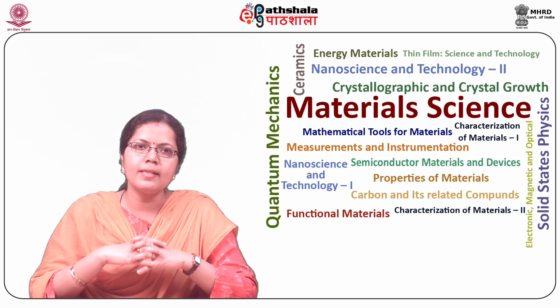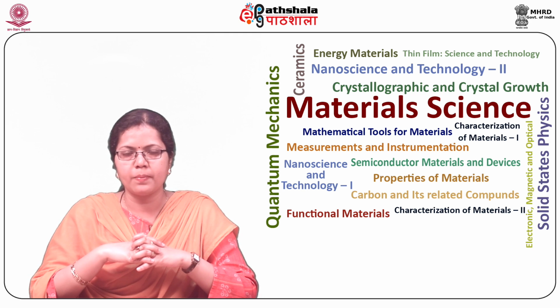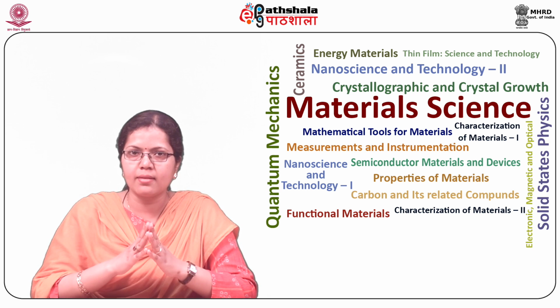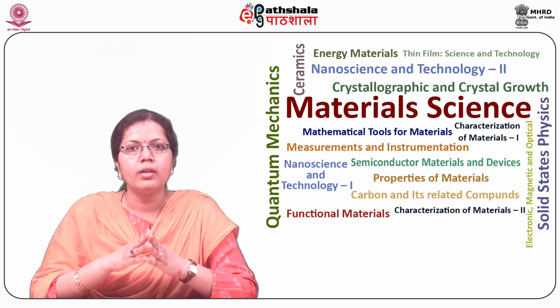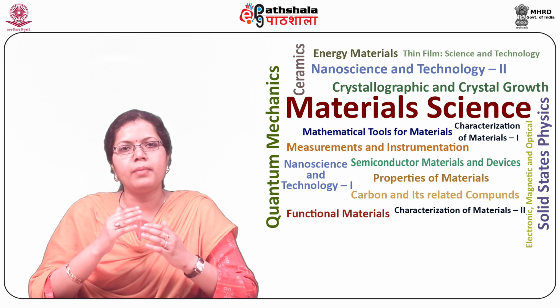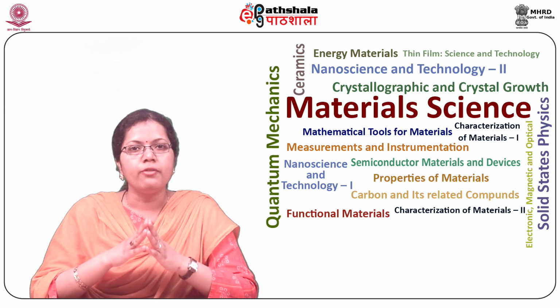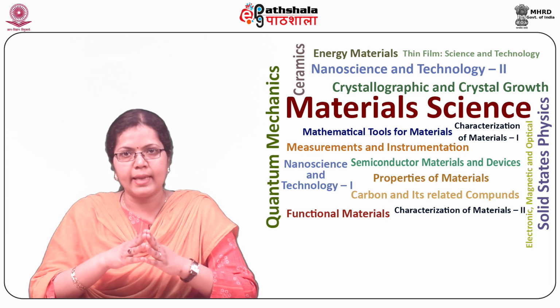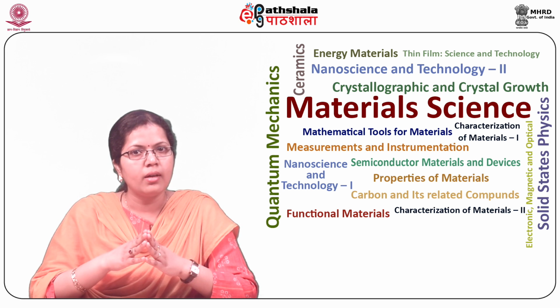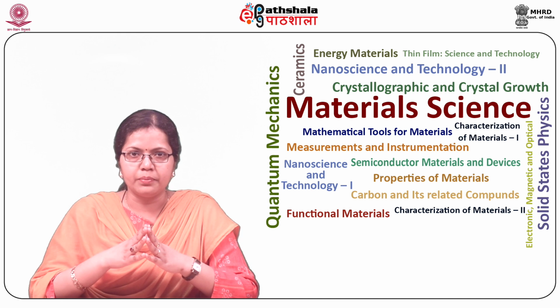Students, now let us understand the magnification of these microscopes. These microscopes achieve magnification by a two-lens system, which comprises an ocular lens and an objective. The majority of bright field microscopes use three objective lenses which have variable magnification powers: 10x low power, 40x high power, and 100x which is almost always oil immersion.